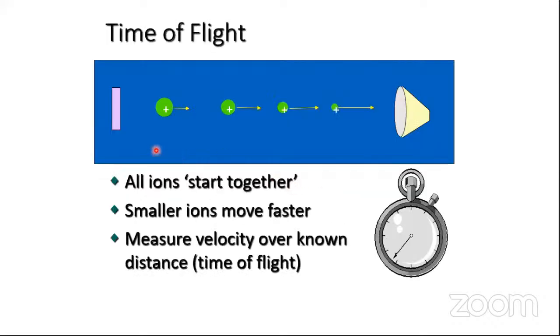Now, if you understand here, when the ions come in front of the plate, they are never going to be in a line. Okay, so some ions, because in the vapor phase, can be very close to the plate. Some ions can be away from the plate. Some ions could be here. Some ions could be here. So when the positive voltage is applied, depending upon the distance of the ion from this plate, they will start moving.